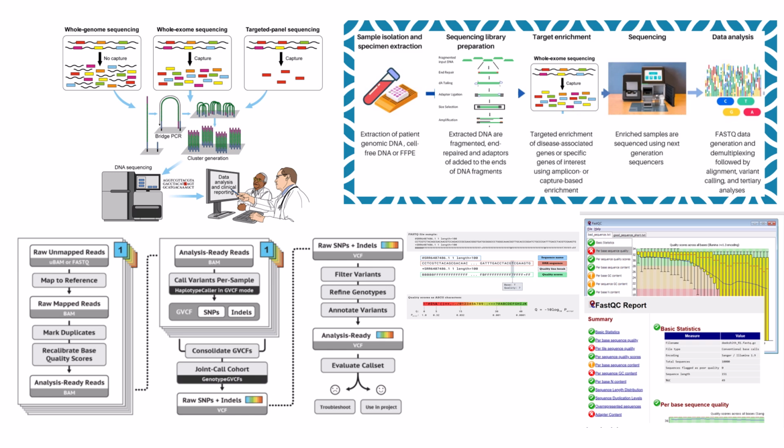After filtering, the high-quality SNPs and indels might be merged back together into one file. And then there's often one final selection step. Using those target region files we talked about way back in Phase 1, the ones defining the exome, for instance, we select only the high-quality variants that actually fall within those specific regions of interest. So you filter for quality, then you filter for location, making sure you're only looking at variants in the genes you intended to analyze. Precisely. So by the end of Phase 5, you should have a much smaller, much cleaner list of high-confidence genetic variations located within your target regions, accurate and relevant. That's a huge amount of refinement.